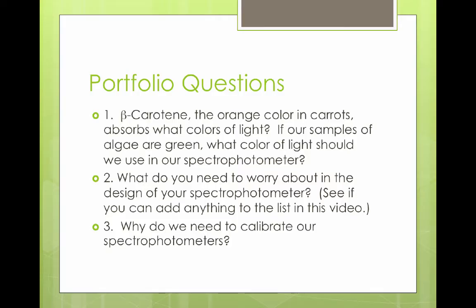Your portfolio questions for this video are, number one, beta carotene, which is the orange color in carrots, absorbs what colors of light? And if our samples of algae are green, what color of light should we use in our spectrophotometer to have the best sensitivity?